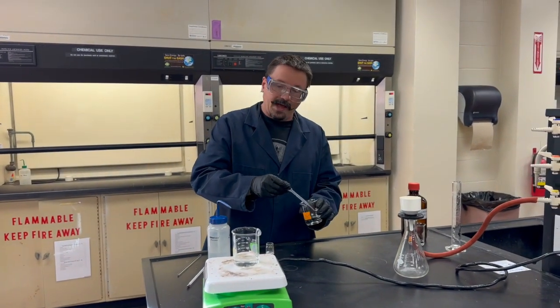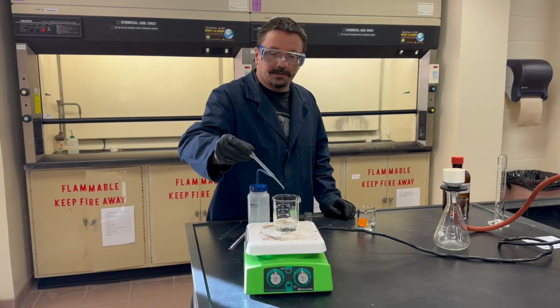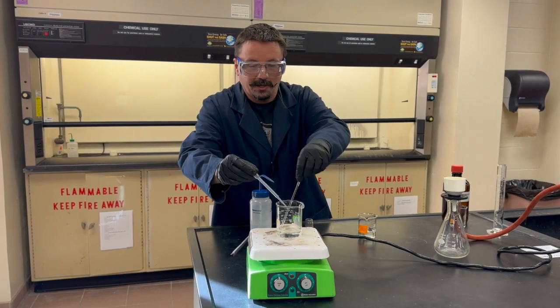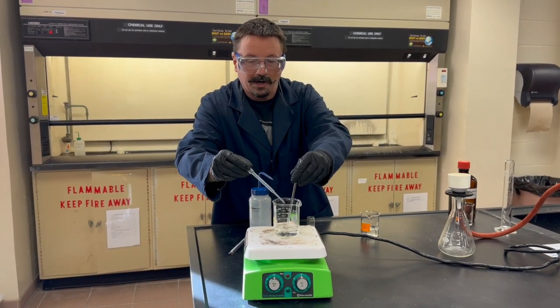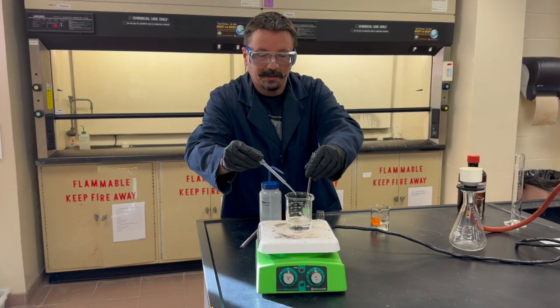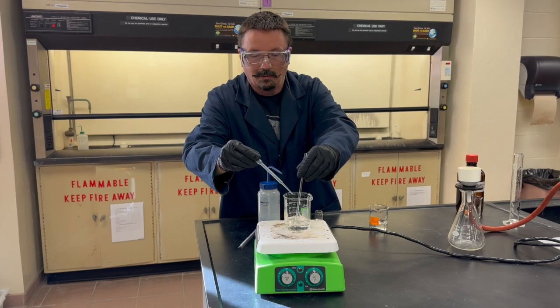Add the barium chloride slowly, making sure your solution isn't too hot and stirring as you go. Doing all of this will help encourage more precipitate to form, which is what you want — ideally precipitating every bit of that sulfate out. This process might take a little while.